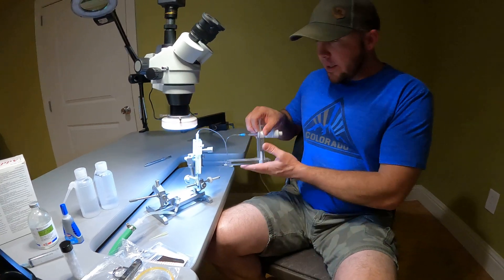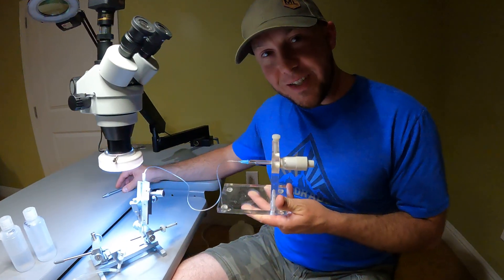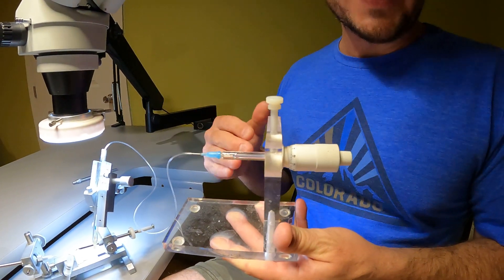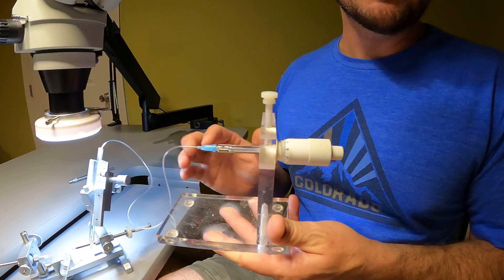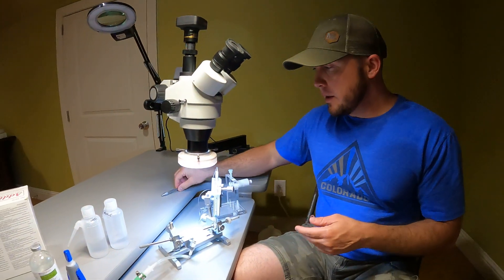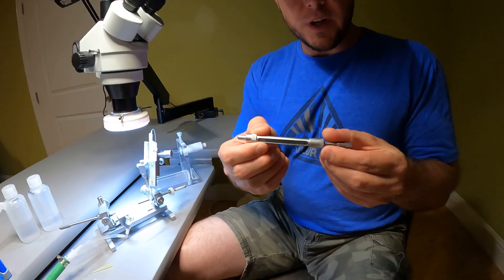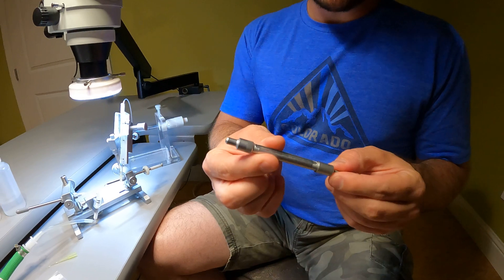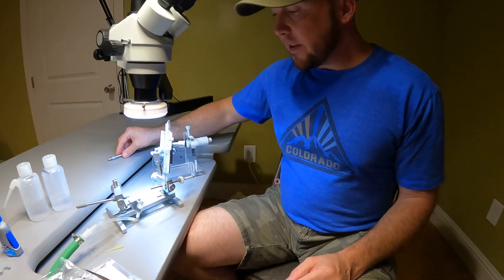We've got the Harbo high capacity syringe. I really like this because it's so precise, but it's got a bigger volume to where you can do 10 or 12 queens back to back. The one that comes with the standard kit is perfectly adequate, but it's smaller — very precise, but you can't do as many queens consecutively.